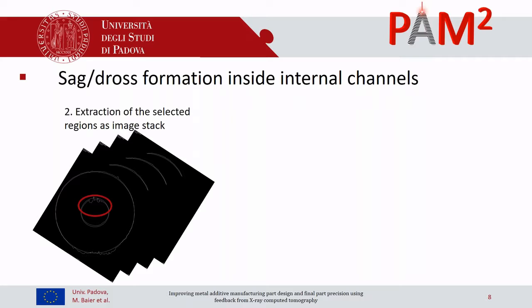So in this case, is overlapping the staging. Yeah, so basically we calculated our field of view, and according to this, we selected the scanning strategy in the CT, and we did it as a batch scan. So we started from the bottom to the top, and in each scan, the moving stage just positioned the part a little bit lower. Exactly, scanning some overlapping. Yeah, of course, otherwise you cannot perform the stitching. The overlapping area from the top, we introduce some.